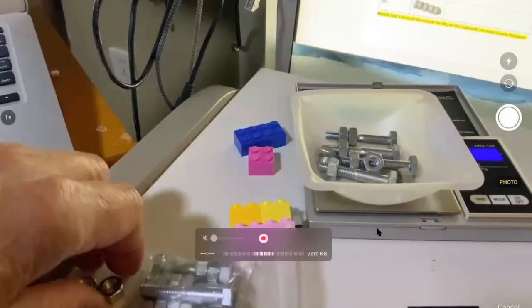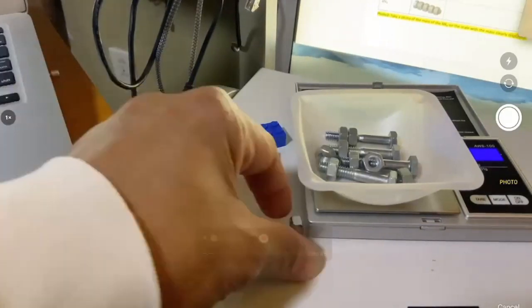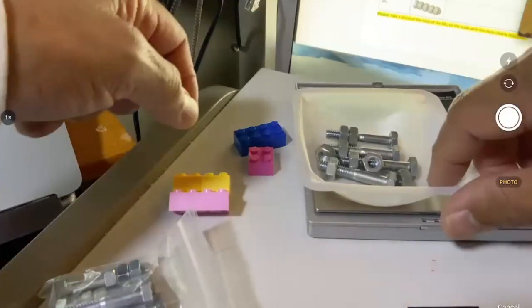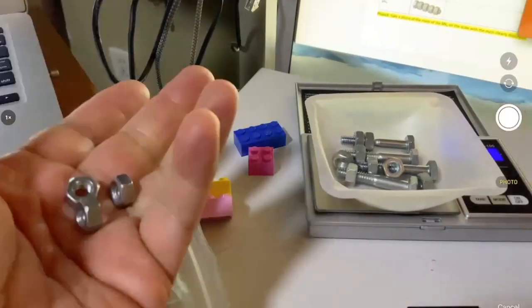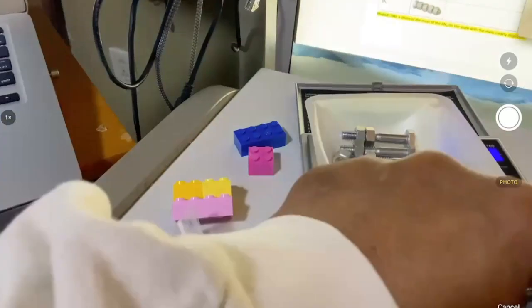BN3, what I could do is I just add 4 of these hex nuts. Okay, now if you're running out, then what you need to do is remove one of these BN2s. You don't have enough hardware, but what you need is a whole BN3.